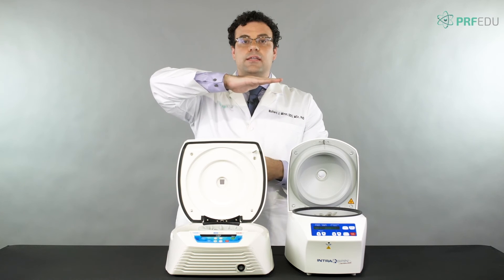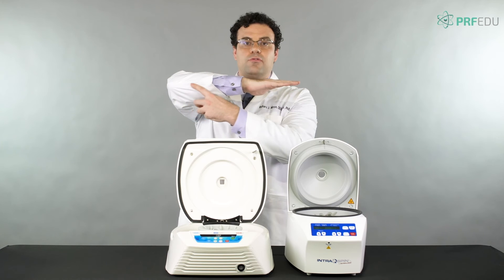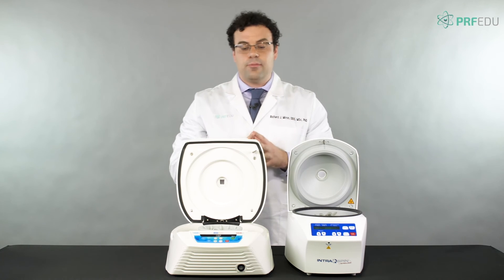In a horizontal centrifuge, the platelets don't have to climb that hill anymore. A platelet starting at the bottom of the tube can travel freely straight up to the top, which makes it far more effective at concentrating platelets and platelet-rich fibrin.